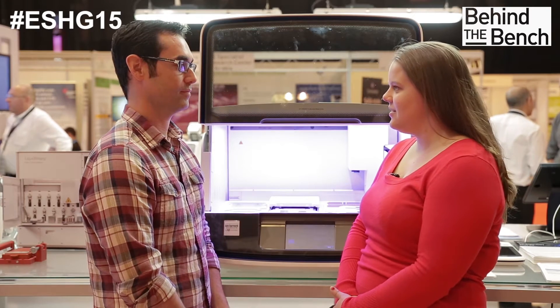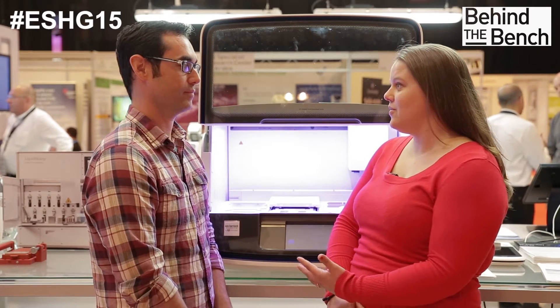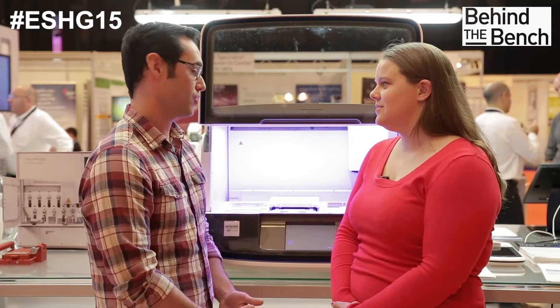Hey Michael, can you tell me a little bit about the ION AmpliSeq library prep workflow on the ION Chef instrument? Sure. It's a really simple solution. We've automated the entire workflow. You'll add tips, a reagents cartridge, a solutions cartridge, a PCR plate, and a foil seal, and you'll simply add your DNA to your PCR plate.